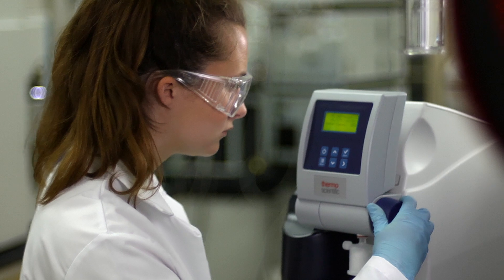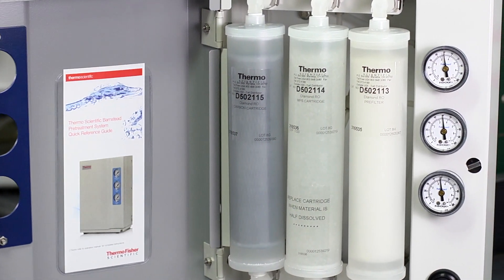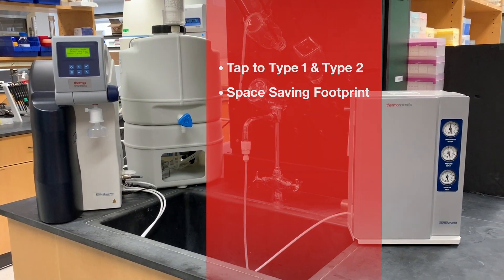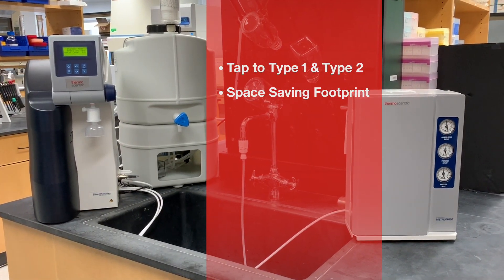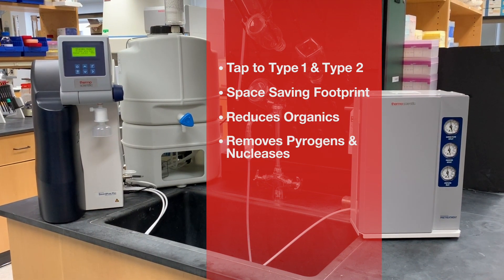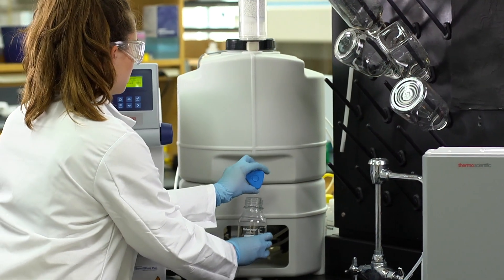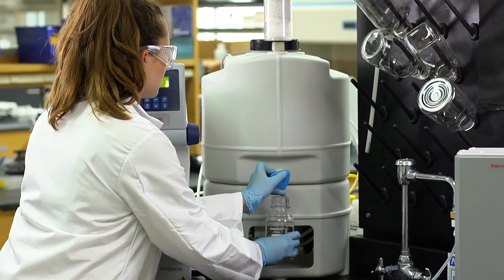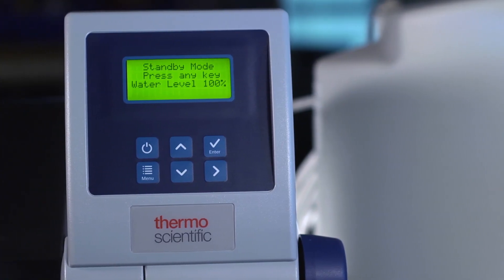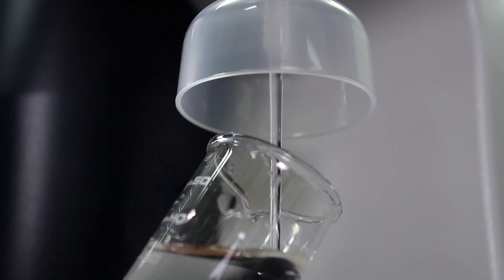Today, the Smart2Pure Pro Water Purification System is a comprehensive solution providing tap to Type 1 and Type 2 water with a space-saving footprint. The system's filters optimize purification performance by reducing organics and removing pyrogens and nucleases. The 30 or 60 liter storage reservoirs ensure the lab has purified water ready whenever it's needed, and the system is designed with a 16 liter per hour single reverse osmosis module for faster water production.